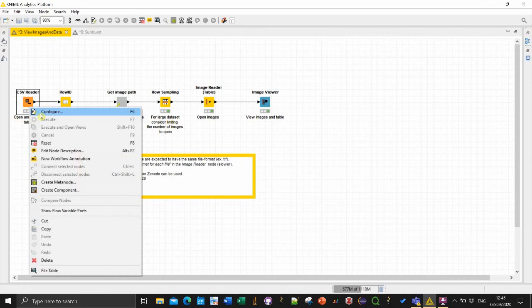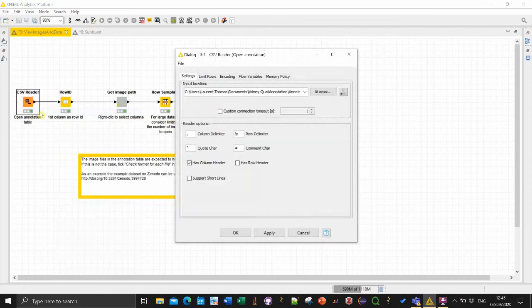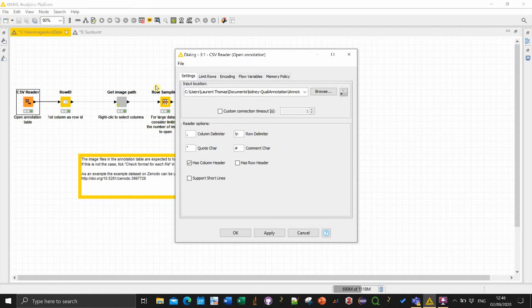So you can right-click, select configure. I didn't mention the workflow, you can simply download them from the github repository.